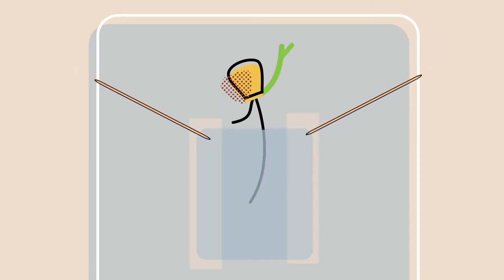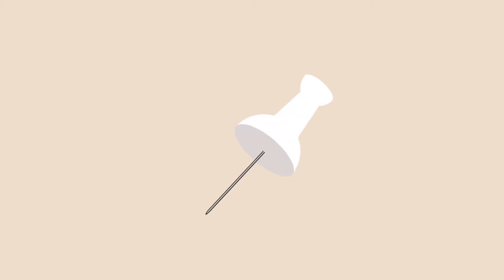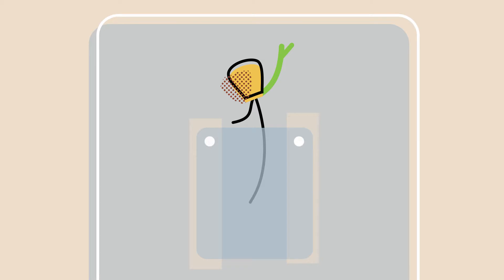I had toothpicks that I tried to use, and tried to poke them through the Agar, but the toothpick was really large and that caused the media to fall apart. I also tried thumbtacks, but because they were made of metal, there was some kind of reaction that happened and the metal started corroding. So that was a problem.